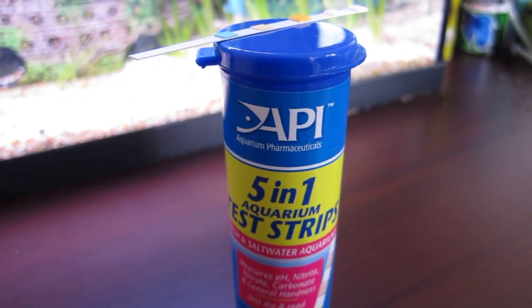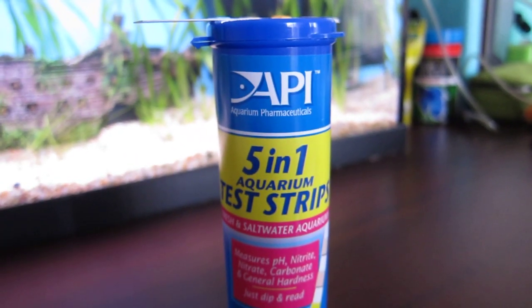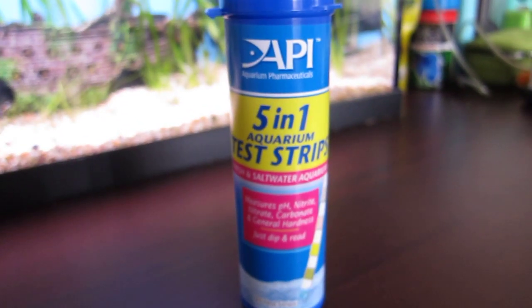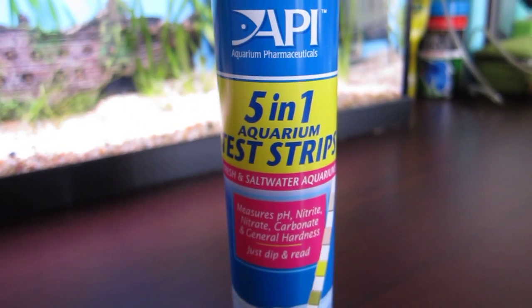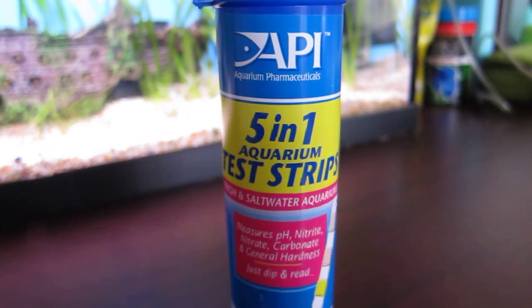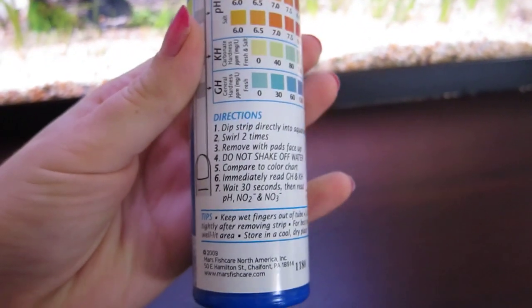Hi guys, I wanted to do another video to get a bit of your help. I've got this API five-in-one aquarium test strips — there are 25 test strips in each tube and this cost me about $30, so it's quite pricey. I was wondering if you guys would be able to help me determine what my parameters should be and if they're too high or too low. I'm going to go ahead and use this; I've used it once before.